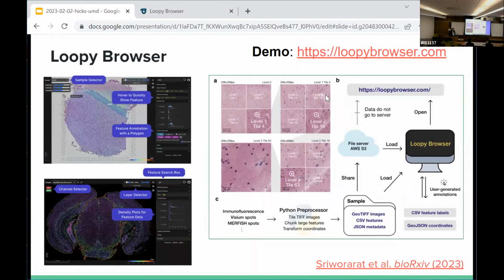Yeah. I have a question in the previous section, but this is a good time to ask it. You touched on this. How well are you able to align biological replicas when it comes to images? In sequence, if I take two tissue sections and I want to line them up, and then using the manual annotation and going back to the gene expression, trying to readjust the manual annotation based on the gene expression.